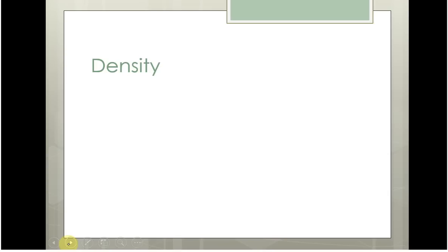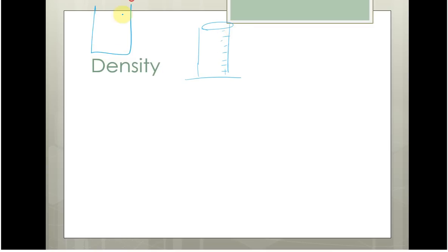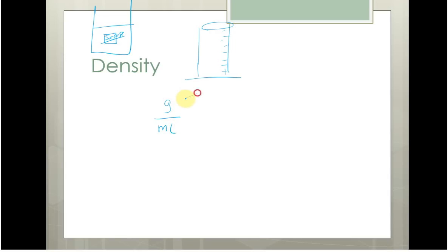The first thing you're going to look at is your graduated cylinder. You're going to have your sucrose solution sitting off to the side with a nice label — your name, the fact that it's sucrose, the percentage, and the date. In order to find density, remember that density is grams per milliliter, so we're going to figure out exactly how many grams and how many milliliters we have for our sucrose solution.